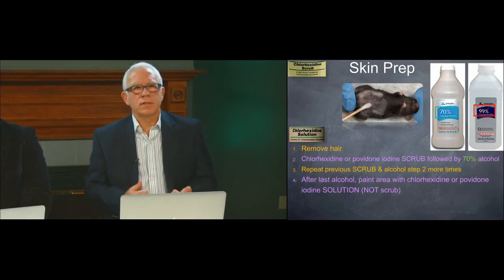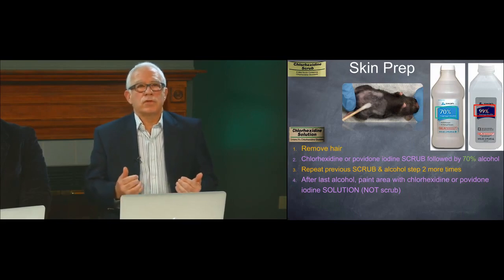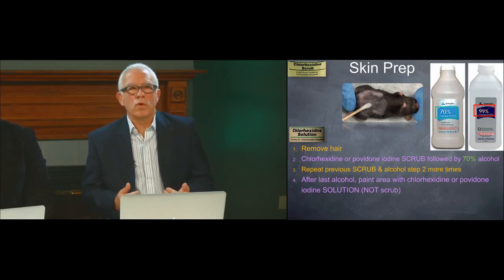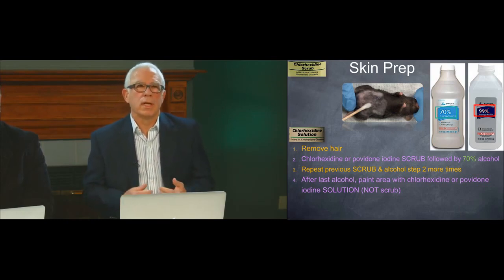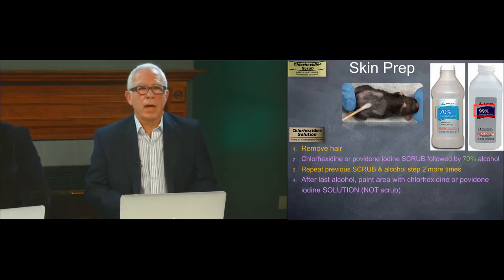Well, chlorhexidine solution is really water soluble. If I use only the chlorhexidine or povidone iodine solution as my scrubbing solution, then I'm not going to be removing some of the grease and some of the oils and debris that are on the skin. It's better than nothing, of course. That's why you apply scrub to begin with. Scrub is really the detergent. It is a soap. So in this Dr. Jones lab, the way they did the skin scrubbing was with a little pad once with povidone iodine solution. So we corrected that in that lab as well.